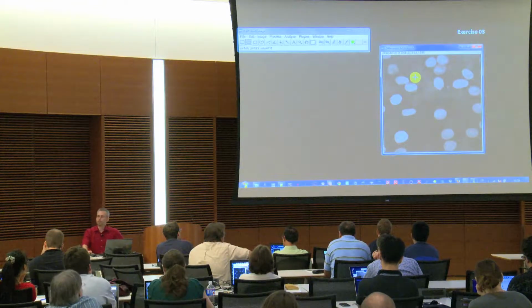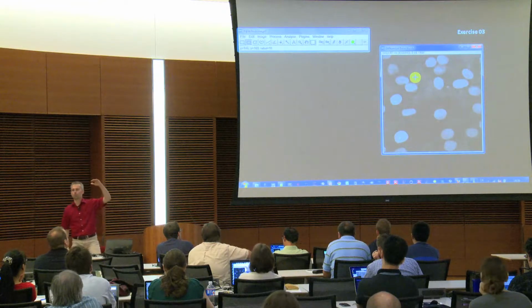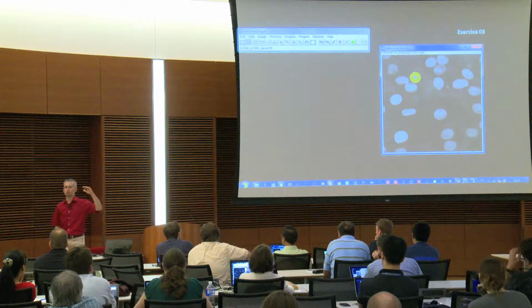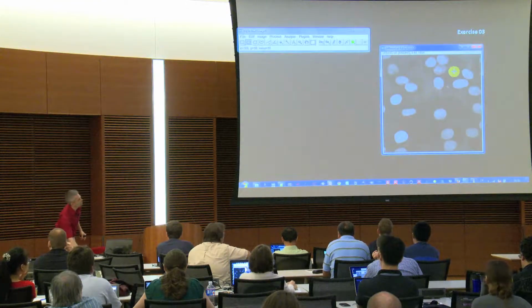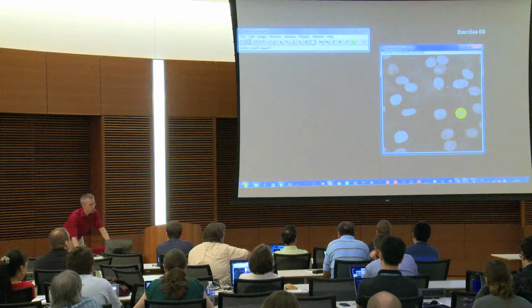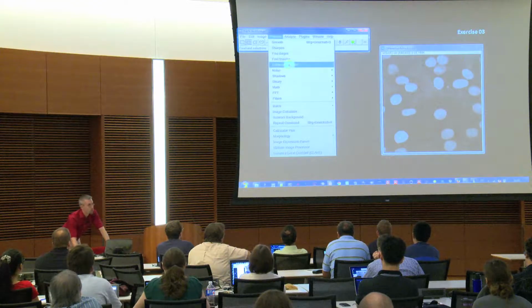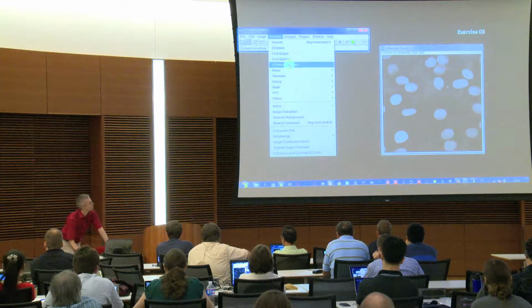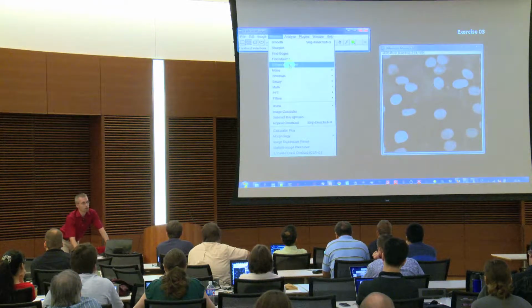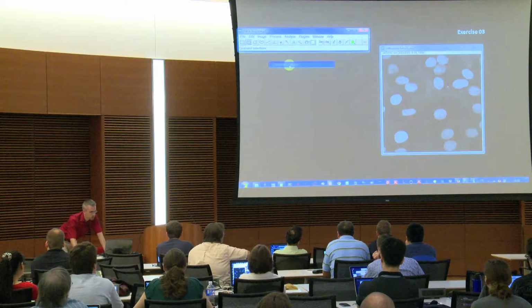In addition, what might be helpful is having a higher contrast. All these convolution filters always reduce the contrast in your image, and having a higher contrast might make it easier to find several thresholds which are working. So we can still enhance the contrast, and one function for that which is very helpful is under Process, Enhance Contrast, because it does it automatically. It makes different images a little bit more similar. So it's easier and quicker than using those manual sliders in the normal contrast and brightness settings.